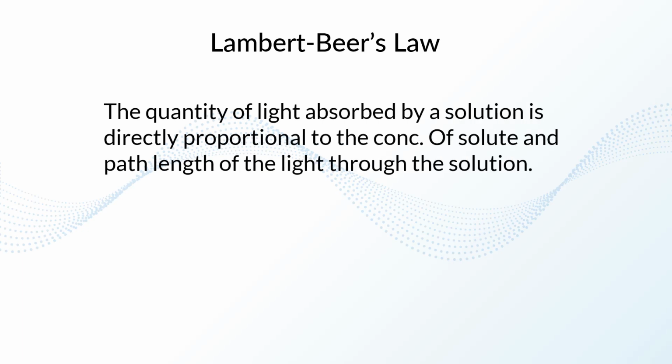The quantity of light absorbed by a solution is directly proportional to the concentration of solute and the path length of the light through this solution. As I told you, now there are two parameters that come into existence.